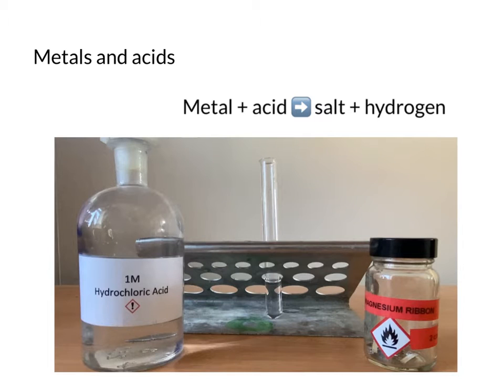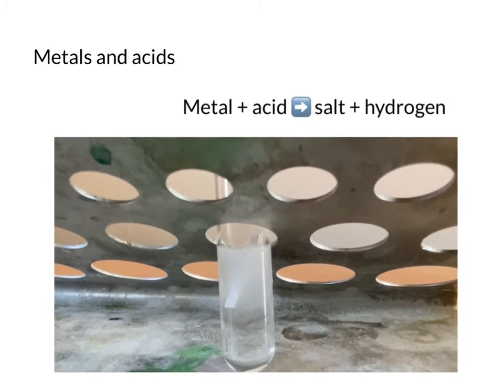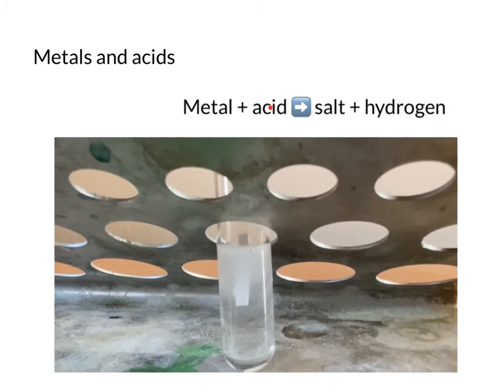This video is about the reactions of metals and acids. Here I'm reacting magnesium ribbon with hydrochloric acid. You can see that there is a gas given off. That gas is hydrogen.